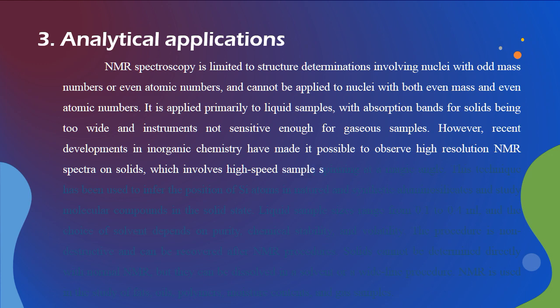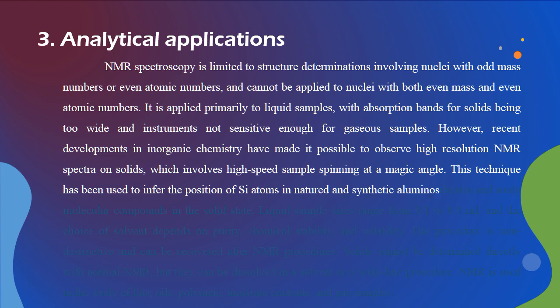which involves high-speed sample spinning at a magic angle. This technique has been used to infer the position of silicon atoms in natural and synthetic aluminosilicates, and to study molecular compounds in the solid state.